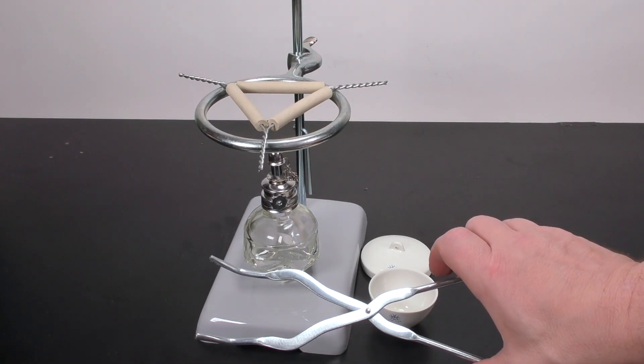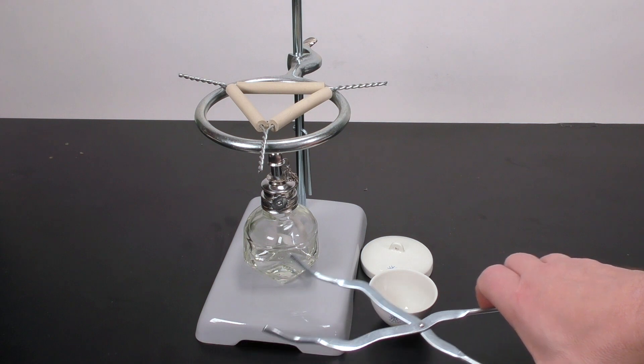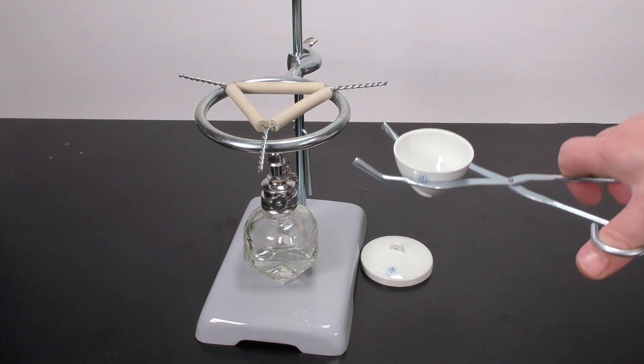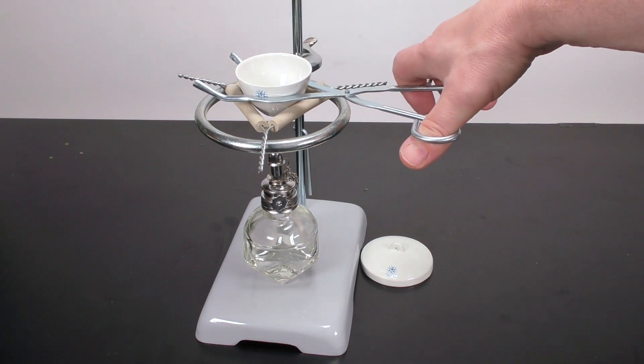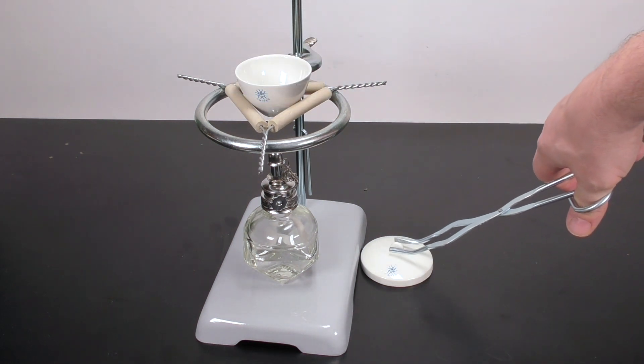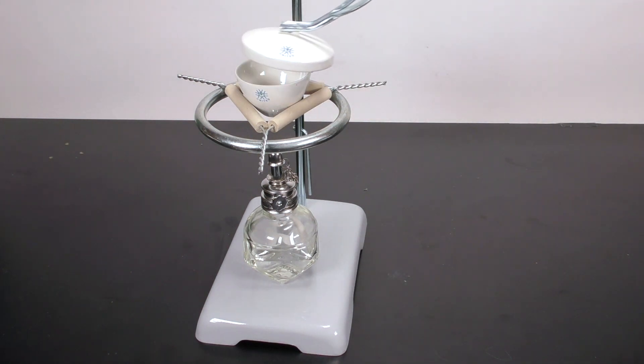You should familiarize yourself with how to use the crucible tongs properly. You want to gently pick up the crucible and place it on the clay triangle and also practice taking the lid and putting it on the crucible.